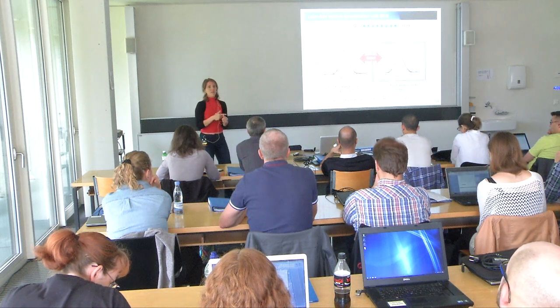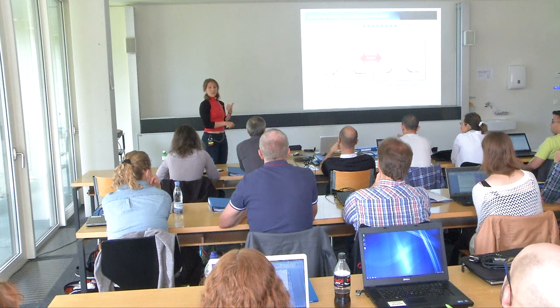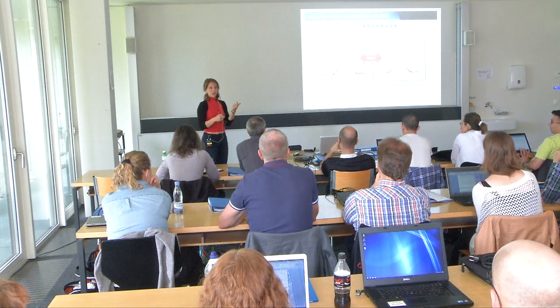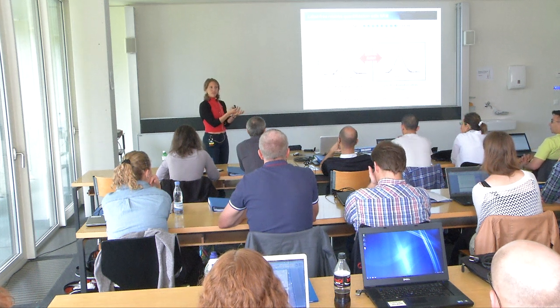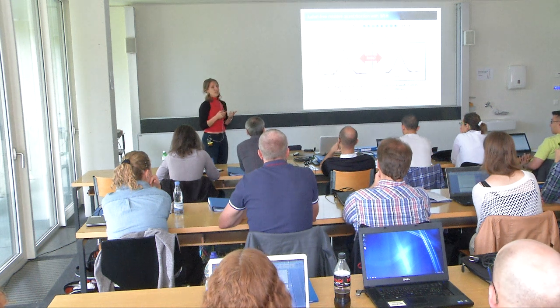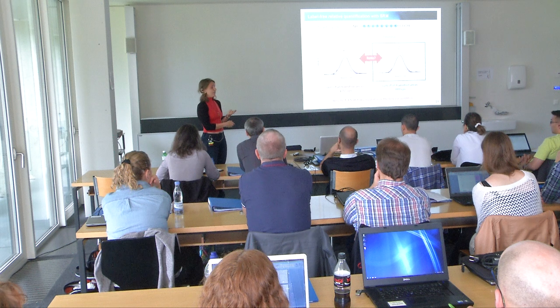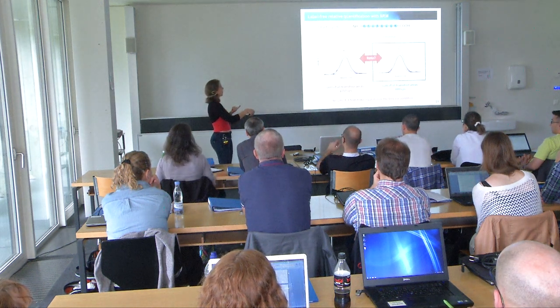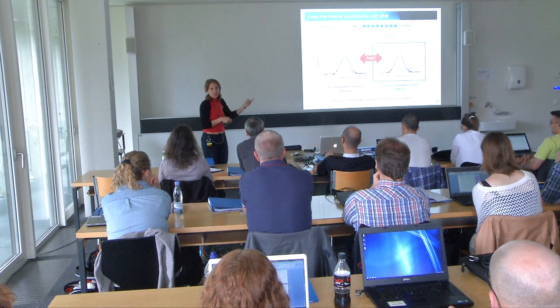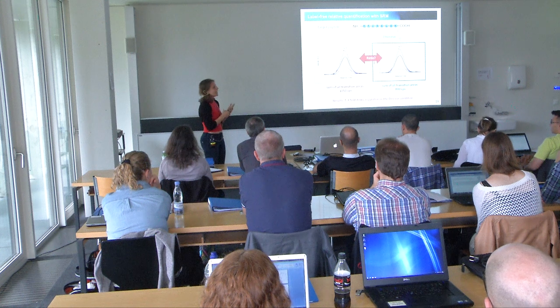One issue, for example, that we don't address at all is that here we are measuring a peptide concentration, but very often we want to derive protein ratios in the end. So how do you combine different peptides to a final protein ratio is one issue. Second issue is normalization. Just by looking at this peak, I'm not sure, have I actually loaded the same amount of proteins in control and disease? I cannot judge this by just looking at this one peak. So there are many issues actually.